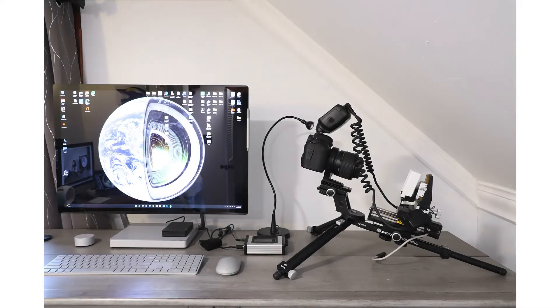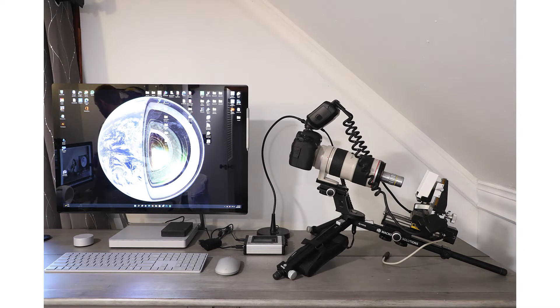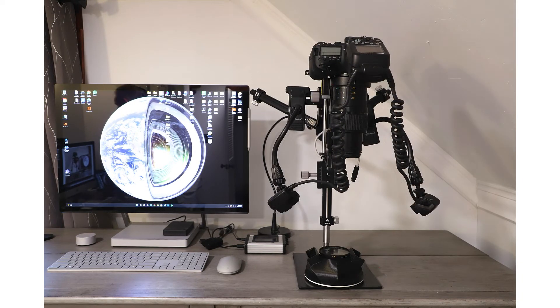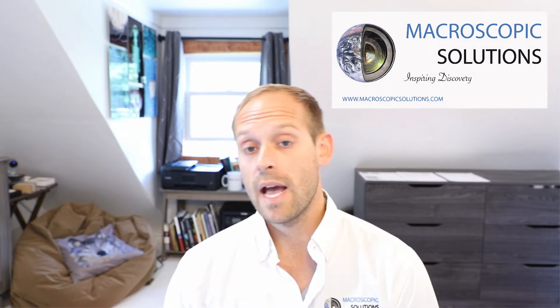The Macropod Pro 3D is a system designed by Macroscopic Solutions to provide scientists in the field or in the lab with a complete imaging system. It's designed to be multi-configurable and portable so you can take it to museums, into the field, or set it up in your lab as your primary microscope. It includes a swath of lenses that allow you to image everything from very large samples all the way down to 50 to 100 microns in size. You can perform high-resolution focus stacking, 3D photogrammetry, and image wet specimens, pin specimens, and slide-mounted specimens depending on the configuration. The system is all-inclusive and includes all the parts needed to multi-configure for any application.